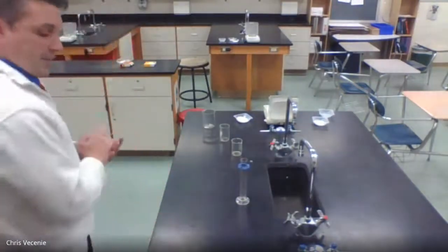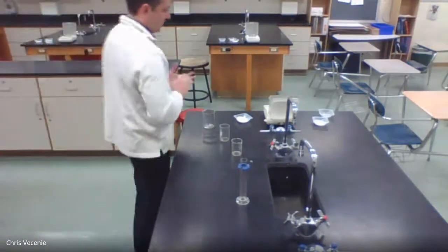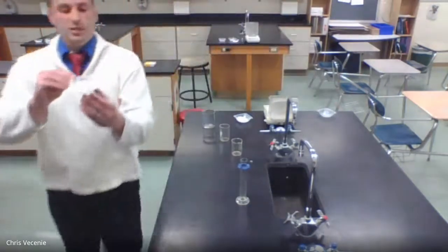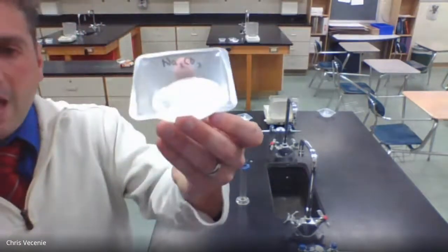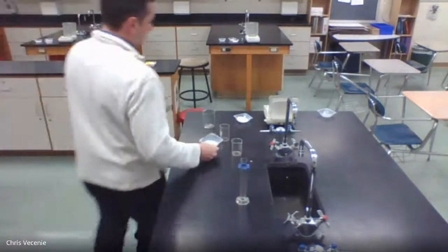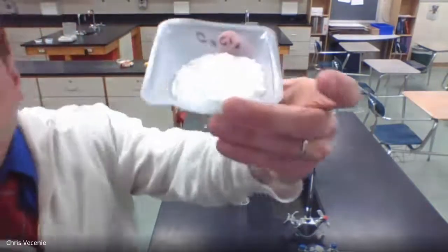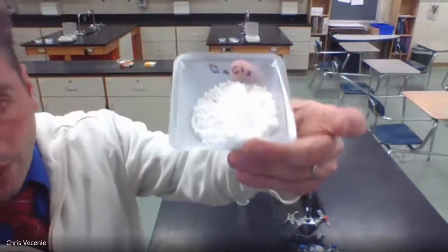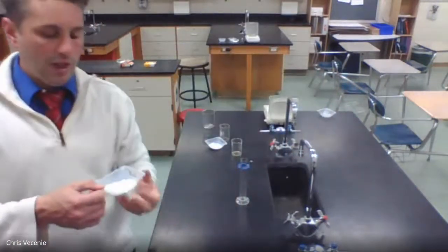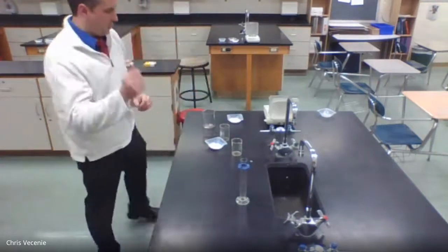The first thing it tells us to do is to get 0.75 grams of each of these substances. In one of these, we've got the Na2CO3, a really fine white powder. In the other, we've got solid CaCl2. Both are white solids, but definitely different. The CaCl2 is more like Dippin' Dots, and the Na2CO3 is much tinier.